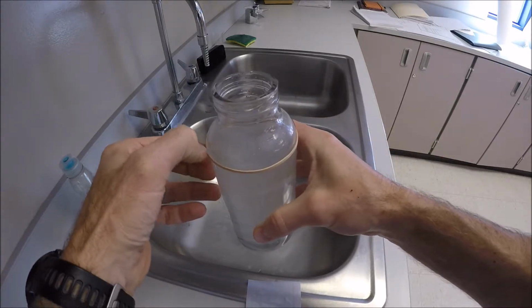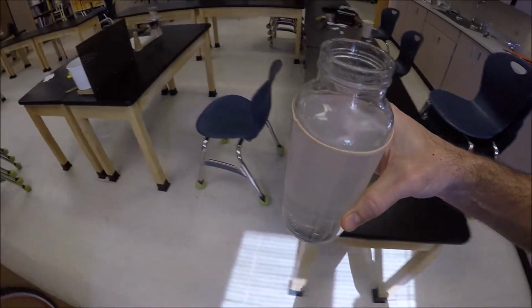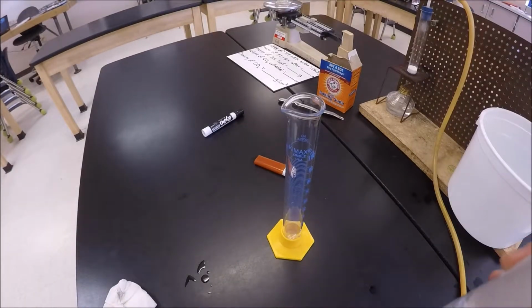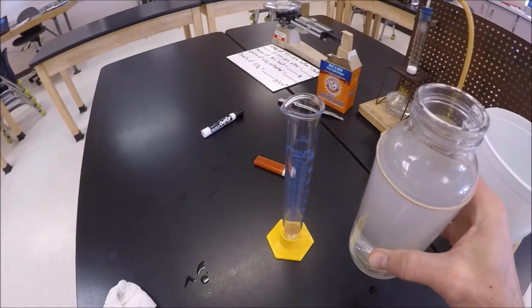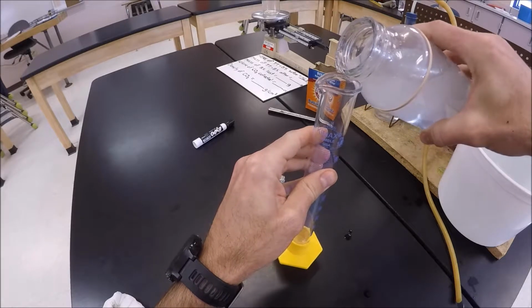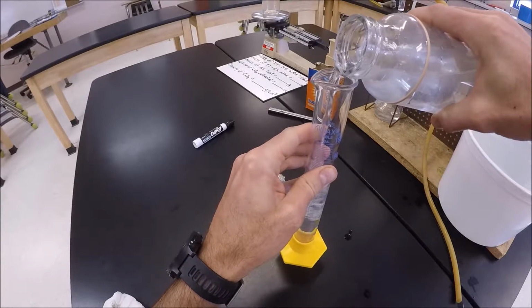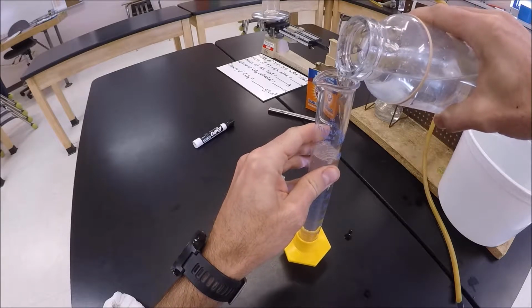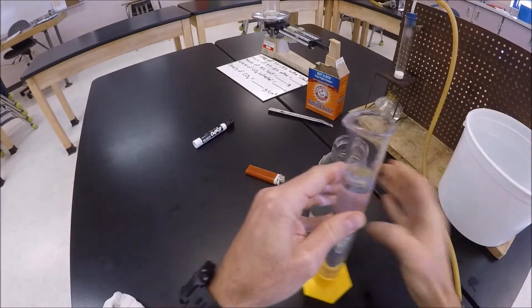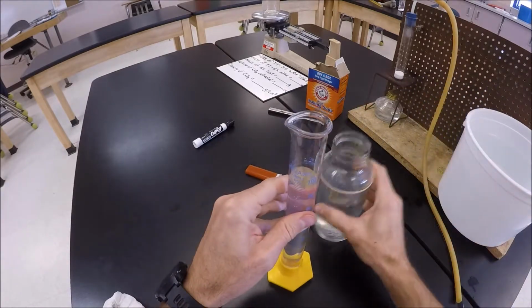And so what I can do now is go back over to our table here, and I can start pouring this into the graduated cylinder. As I do this, I want to do it 100 milliliters at a time, being very careful not to spill. Just put a little back, don't make a mistake. Try to be as accurate as possible.